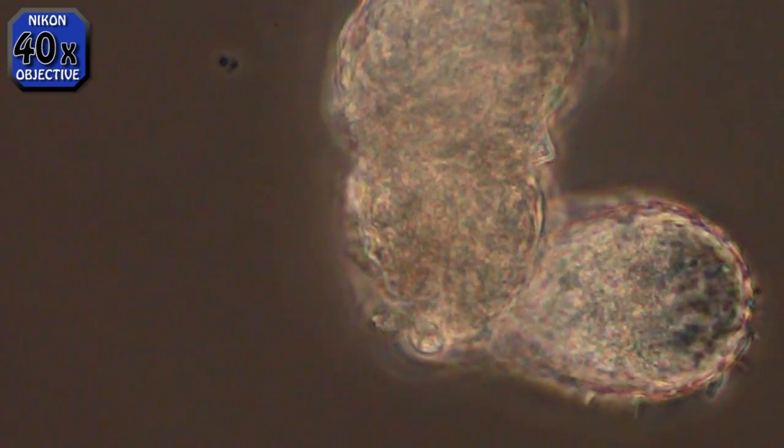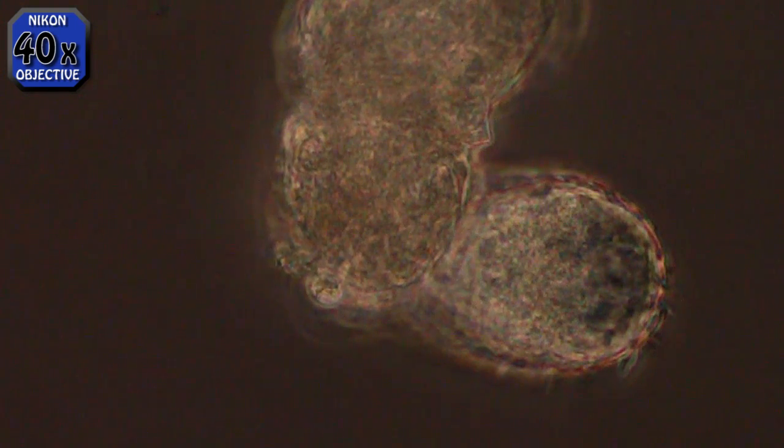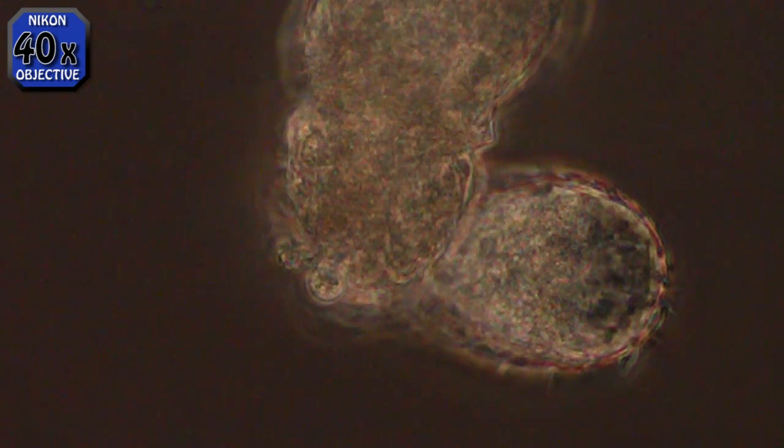He's turning the chicken leg there to get a better bite on it. I never did get a good view of his tentacles, which are at the narrow end of him and are probably doing all the eating.